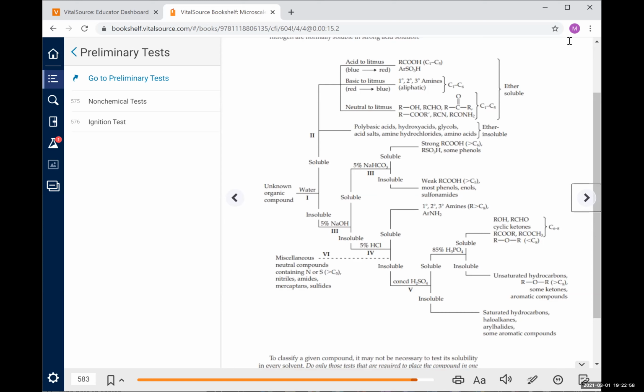Okay. Thank you. One important thing about amides compared to amines or carboxylic acids is that they're litmus neutral. So generally you wouldn't see a change when you dissolve the amide in water. If you test the pH of that solution, you would expect to see a neutral solution.